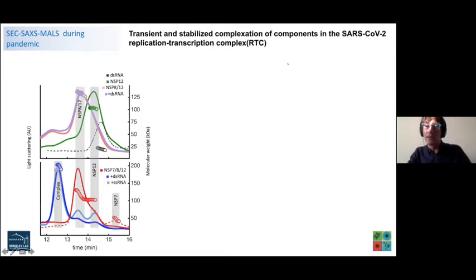Matthew, have you a couple other separation techniques? Oh, okay, that's a good question. We are working on it. We're thinking about different columns, not only size exclusion coupled SAXS, but ion exchange columns are doable. It's more difficult because you have a salt gradient in this kind of system.